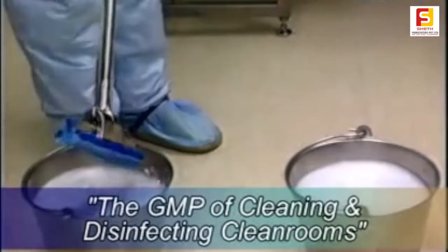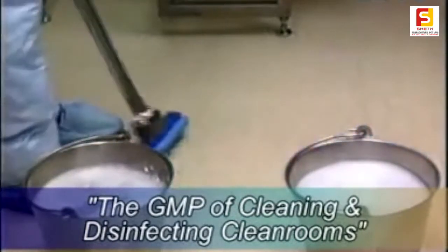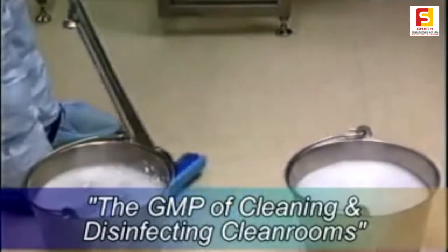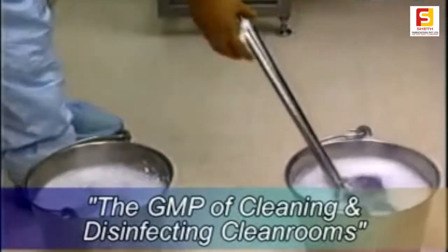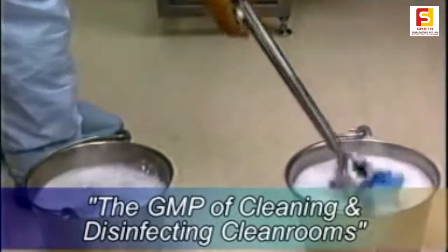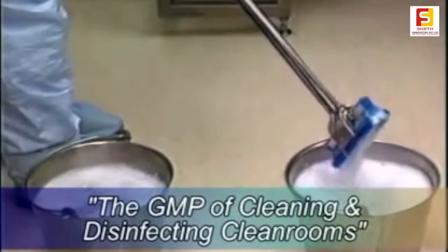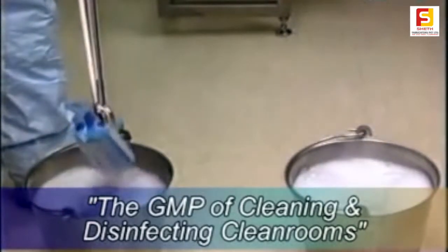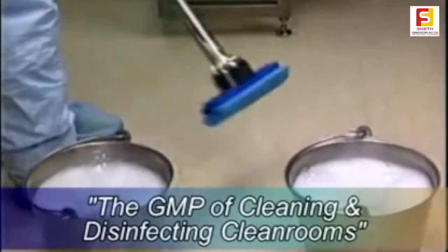The two-bucket system uses two buckets of germicidal cleaner. One bucket is used to apply fresh solution and the second bucket is used to rinse the mop and as a container to hold the used solution picked up from the floor. Obviously, if the SOP specifies the two-bucket system, that's the one to be used as it's been validated.